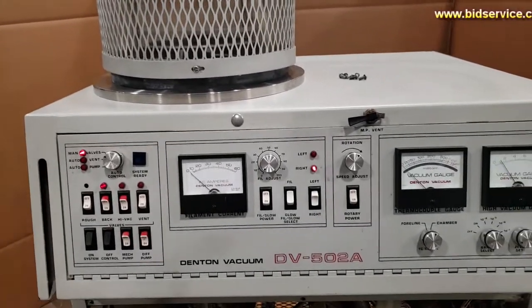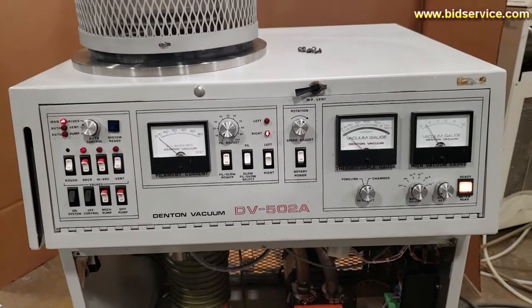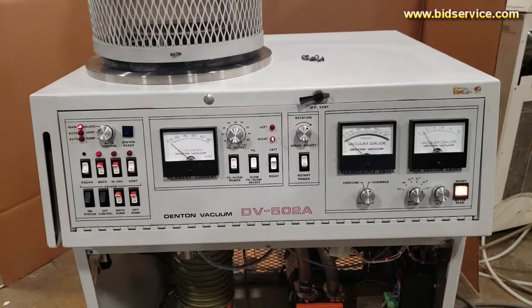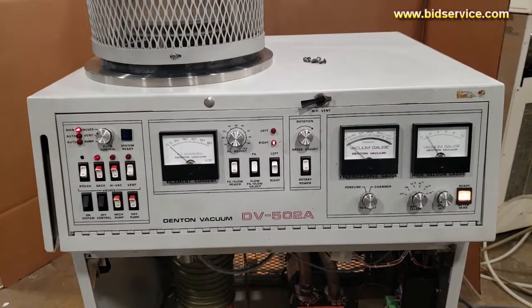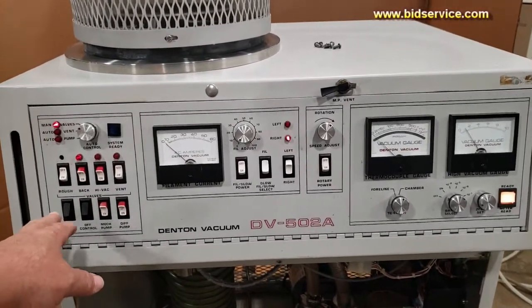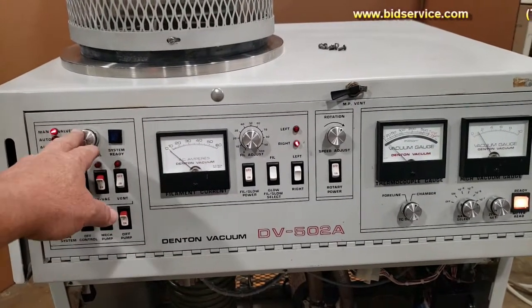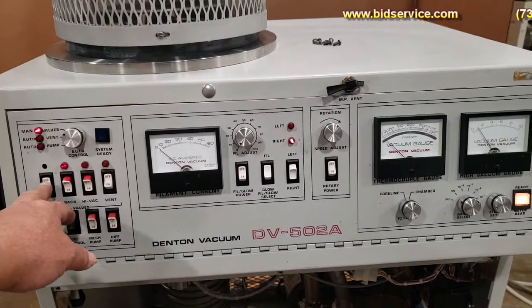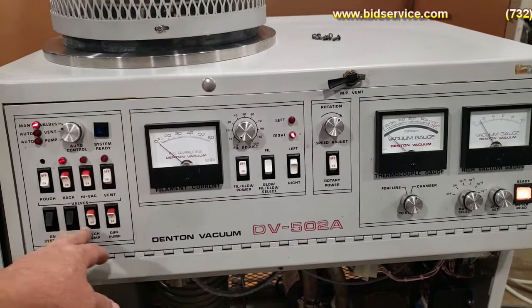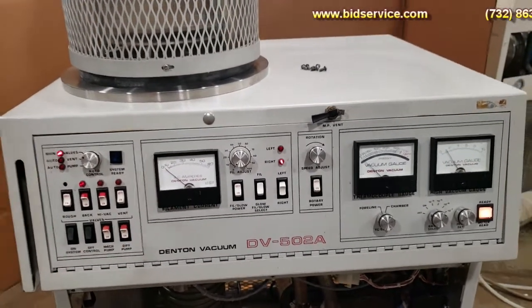Down below the bell jar we have your control panel, which on the left-hand side consists of all your valving to turn on the system to pump. Over here is your automatic pump, your valves to turn the system on and off, and your mechanical and diffusion pump switch.